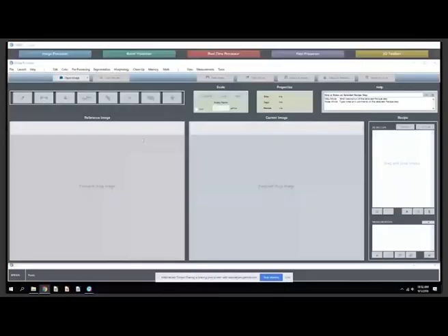So here we have MIPAR open. These are our 5 applications that come. The 3D toolbox comes as part of our 3D extension. The image processor is probably where you'll find yourself spending the most of the time. It's where recipes are built and run on single images. The batch processor you'll see in action, where you can take a recipe and apply it to hundreds or thousands with just a few drags. And the post processor here, you'll also see, is our batch review, our batch quality assurance environment, where you can actually see the results of your bulk image processing before you make the all-important measurements.